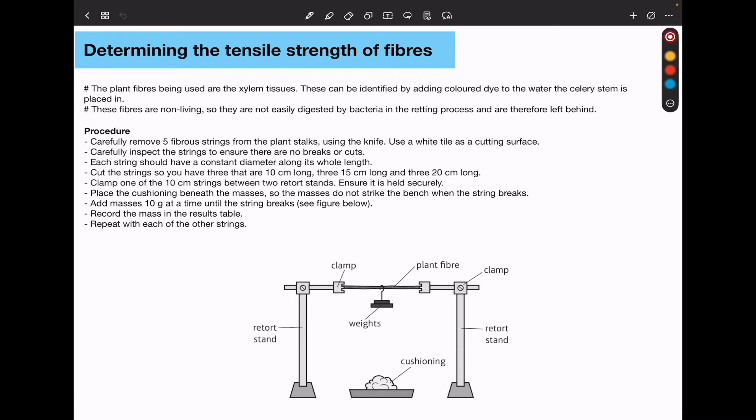In this Core Practical, we're going to be observing plant fibers. These could be xylem tissues. They can be identified by adding colored dyes to the water. The plant celery stem is placed in.